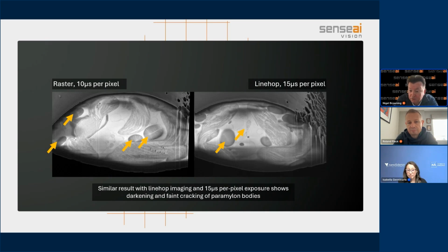It will have a lower dose. Obviously, you'd have to understand the full dose fractionation and how much dose you put into it inside of the SEM, because you're still going to have to worry about that for the tomography experiment. But because we can do much lower doses in terms of the process, it should be easy to do that. Of course, it would also apply the subsampling to cryo-ET as well. So you could do lower doses on those and get the same information to come out. So distributing the dose can work in multiple different ways rather than just one, in terms of the process that we're using.